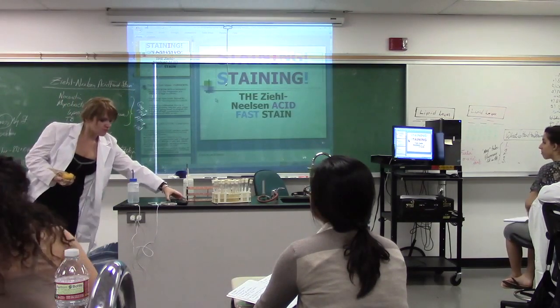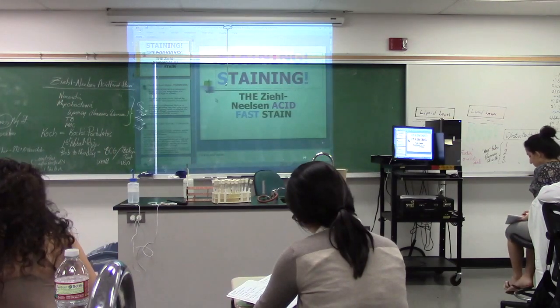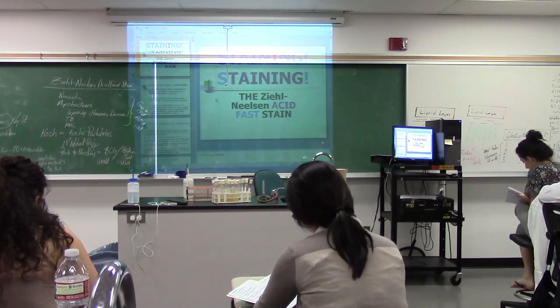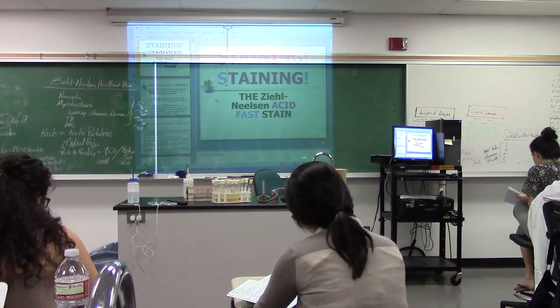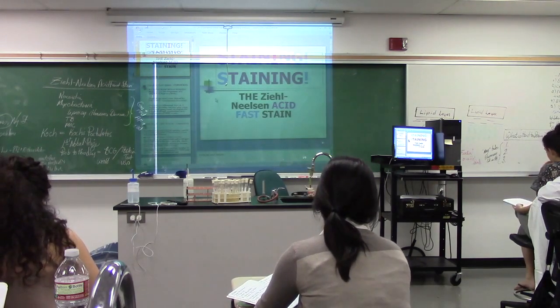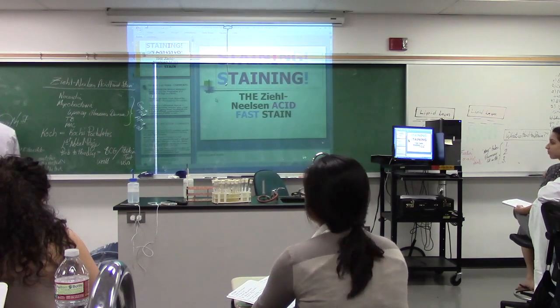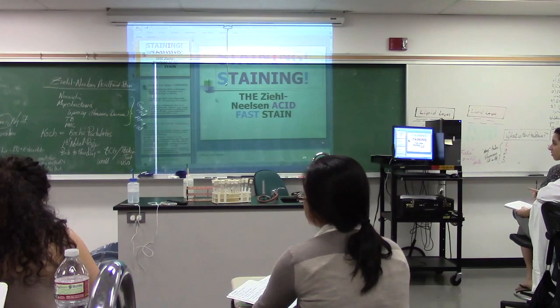The key to the endospore stain is one word: holes. Like in your brain, cheese, holes. Okay. All right, or in your head. So anyway, we'll talk about endospore stain interpretation, theory, and problems, and we're going to have a pop quiz on reading all the stains, and it's called Name the Stain Game, and that will be the pop quiz on Wednesday.